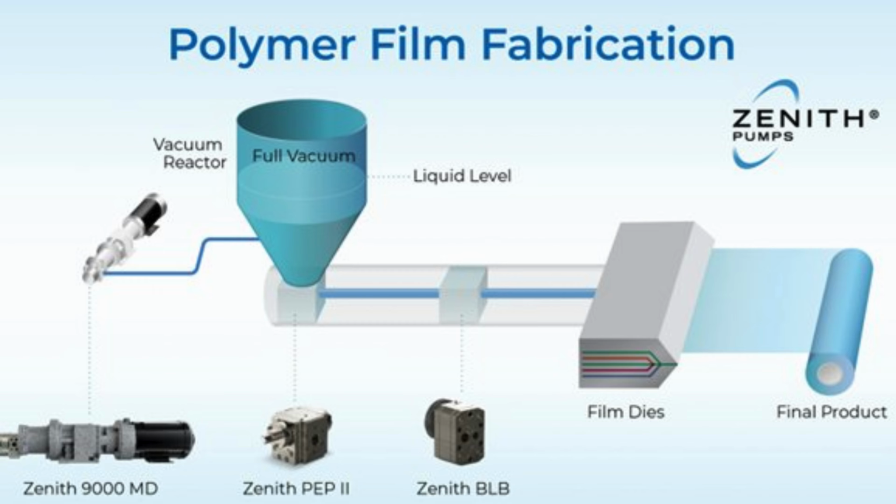Film formation typically occurs through mechanisms such as solvent evaporation leading to polymer precipitation, thermal softening or melting followed by solidification, mechanical deformation that induces molecular orientation, or field-driven deposition processes such as centrifugal or electric forces. Through precise control of these parameters, it is possible to tailor film thickness over a wide range from nanometers to millimeters, as well as to manipulate morphology, ranging from amorphous to highly crystalline structures, thereby optimizing functional performance.